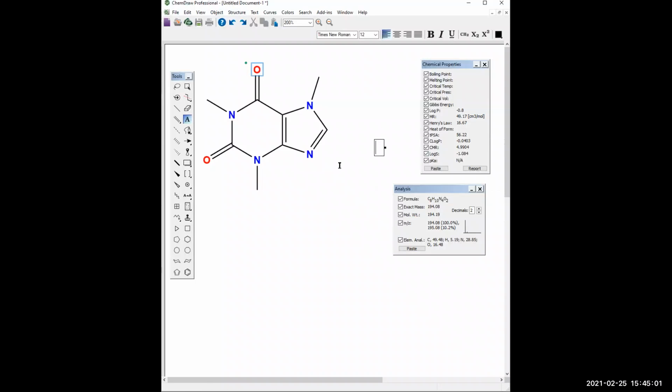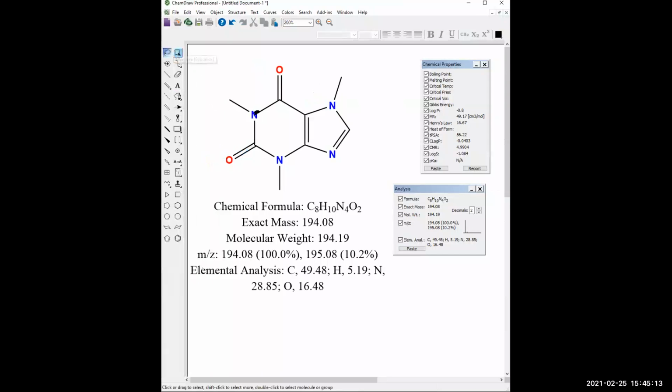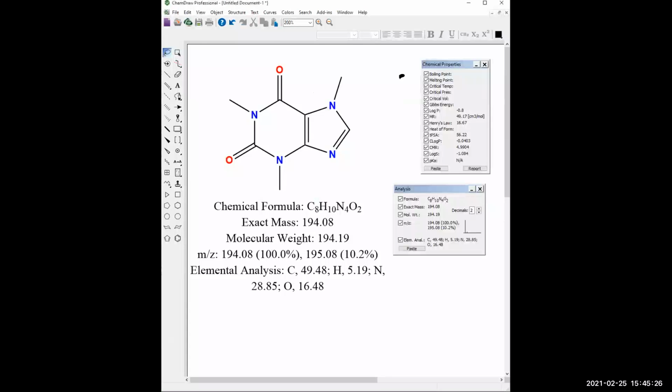Let's undo that. It's pasting it over there because I have a text box open with the text tool. Let's undo that and click paste so we get it here down below. Sort of move this out of the way and to the side. And then we can paste any of these here as well, or we can report.